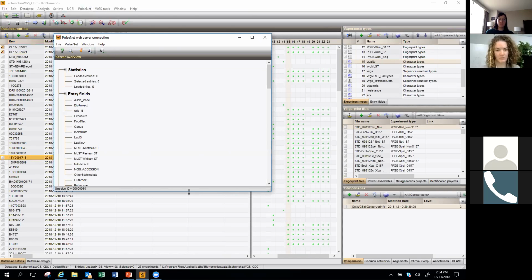So we do expect to have that if the point is to have sequences that are passing quality, then they need to have at least the core at 95% found. And that's pretty doable. It's not a hard thing to achieve if everything went well with sequencing.